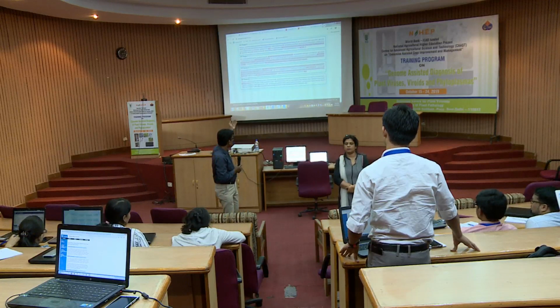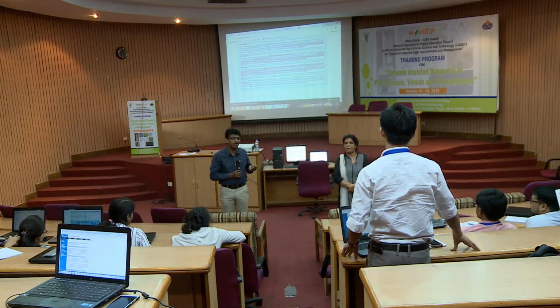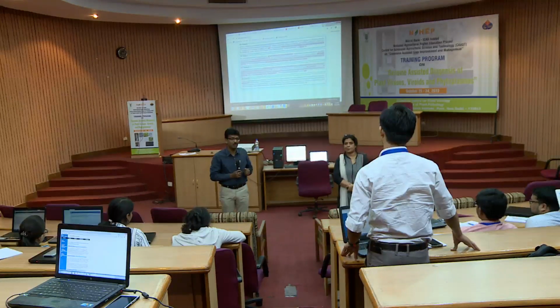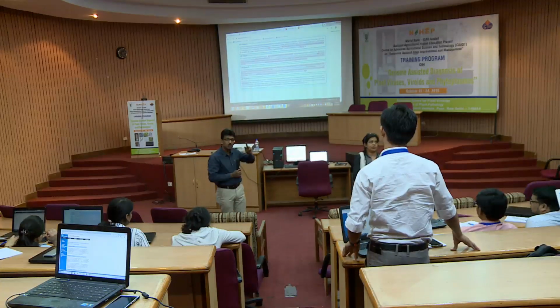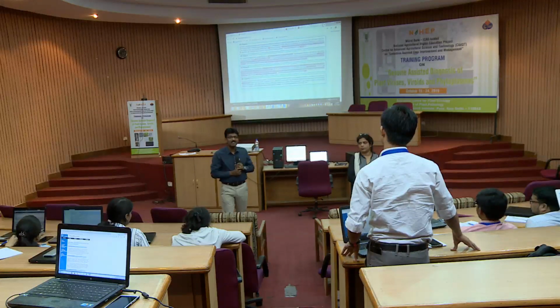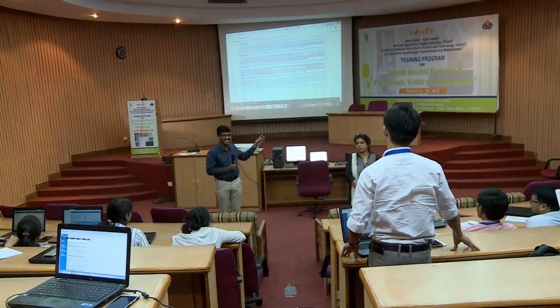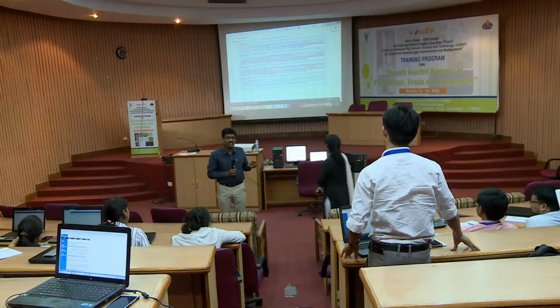When you do the flat file making, what name will you give, genus name and species name if it is a cellular organism. Maybe it's true with viruses also. You have to give the correct phenotypic information in the data sheet, right? These two should match. Why? Because your mistakes will amplify with time and space. Let us not forget. So here comes the quality checks nowadays.